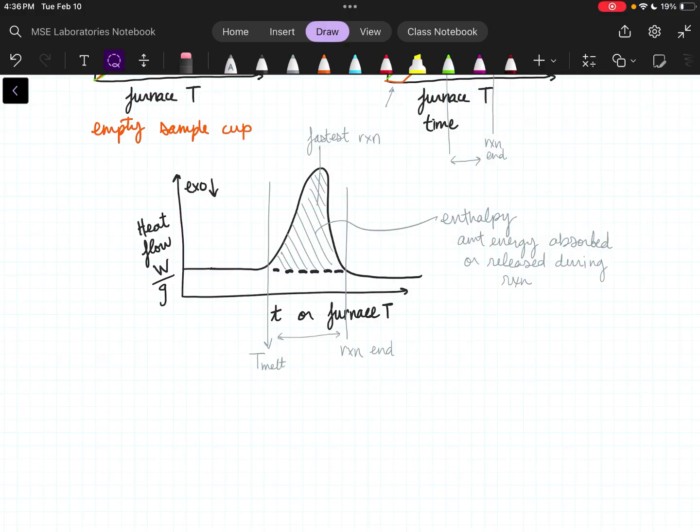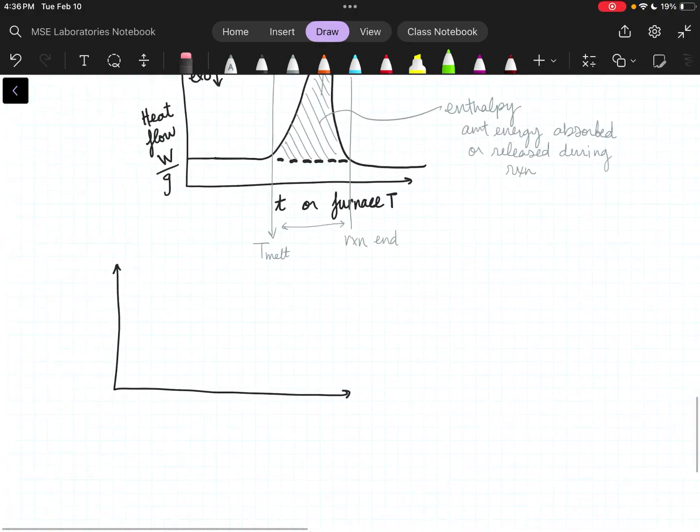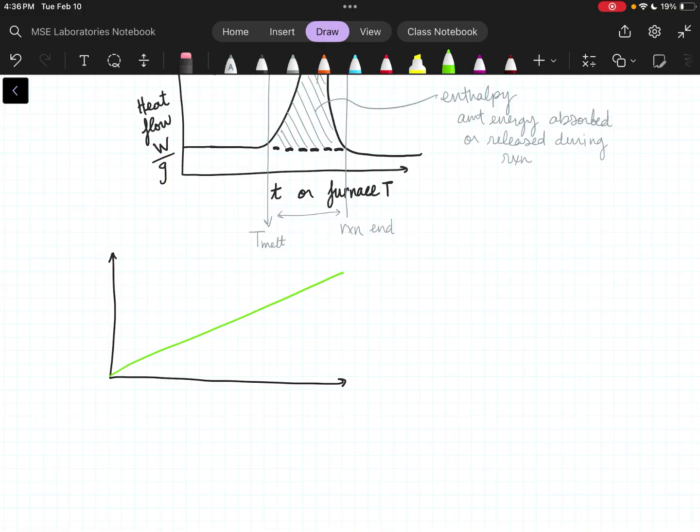Okay, awesome. I talked about heat capacity. Nope, we'll get to heat capacity in this conversation, but I talked about glass transition temperature a minute ago. So glass transition temperature, I mentioned, is not necessarily an endotherm or an exotherm. So you're like, so what happens during the test? How does that look? Going back to my DSC, the raw data lines, and this is specifically for glass transition right here.